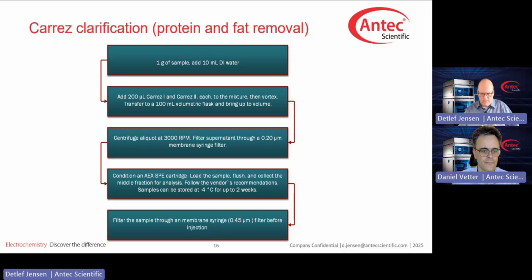And all of a sudden, the retention times will be matching the retention times of your non-salty standards. So a very clever way to get rid of the anionic contamination due to the sulfate from the zinc sulfate. So Detlef, that's really great to learn about this and also the effect of the sulfate and the alternative, the zinc acetate. I've spoken with customers who reported exactly the same behavior that you described, a retention time shift between standards and the samples.